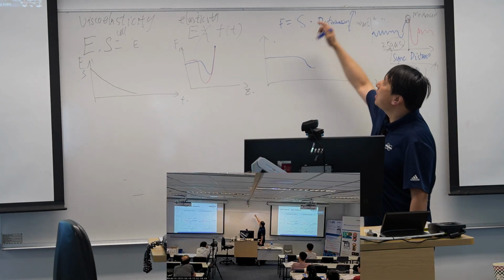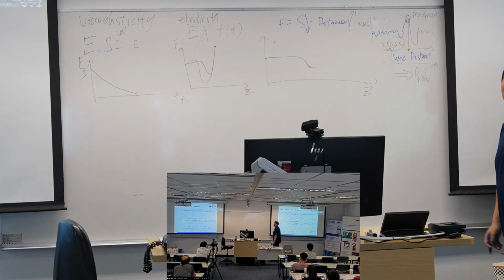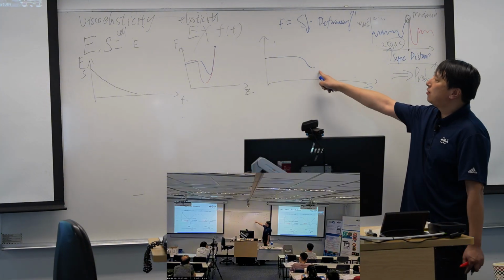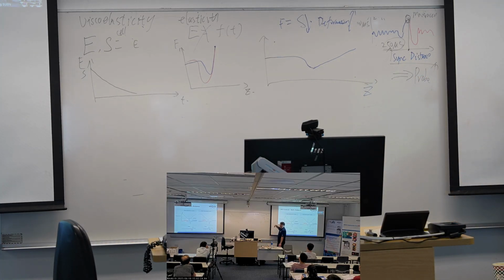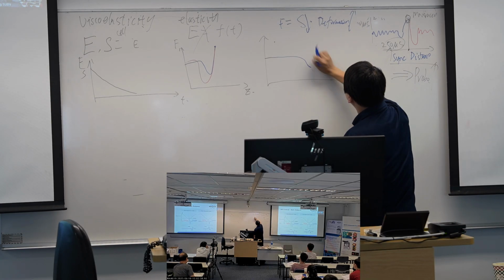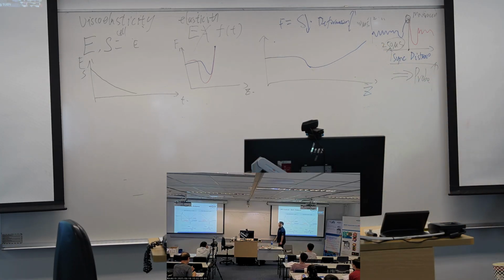But at the same time, the stiffness is reducing against time. If I do it slowly, then our force curve is something like this, right? It will increase quite slowly. That's the force curve we expect to get for those kinds of cells.